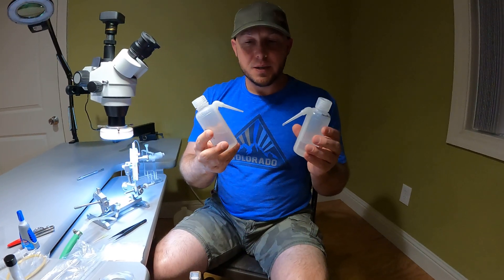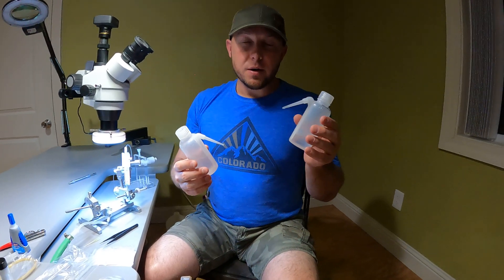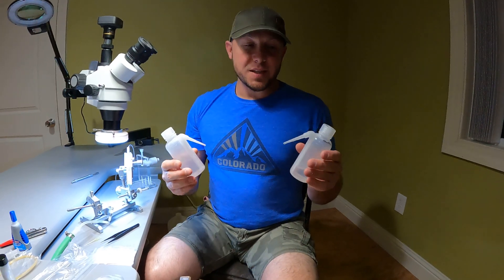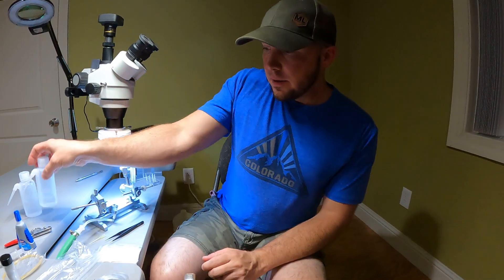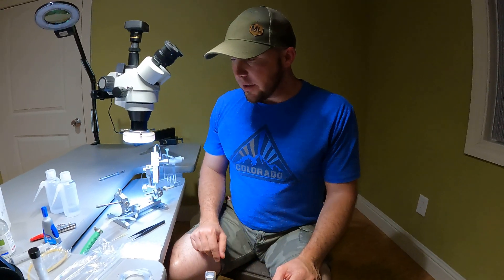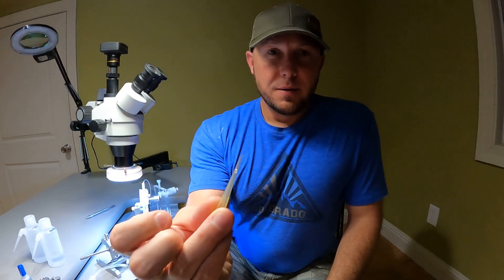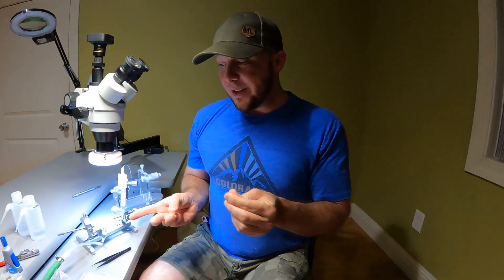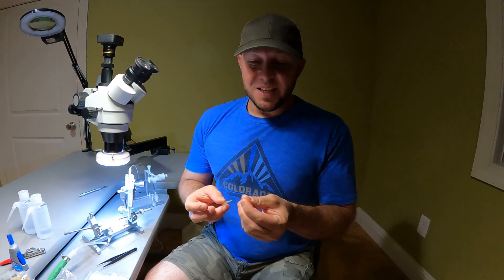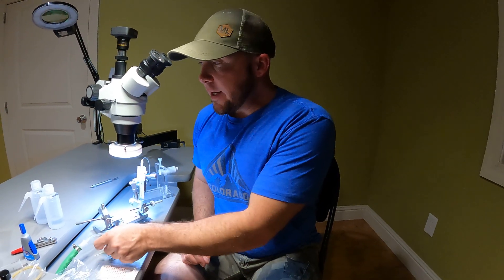These little wash bottles — eight ounce or so — are really handy. Fill one with alcohol to sterilize your tip and equipment, and then one with distilled water to flush it afterwards. Flush your tip before you start to use it. This wire tool is really handy — it's just a very fine piece of wire. If you get mucus in the end of your tip or it dries out and gets plugged, you can easily clear it out with this. You'd be glad you had it.